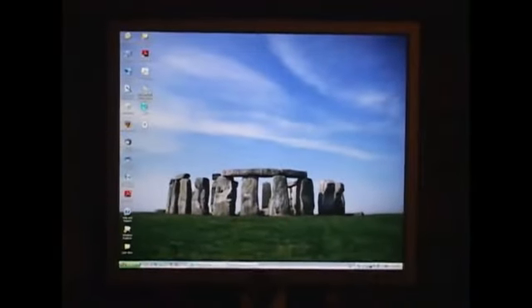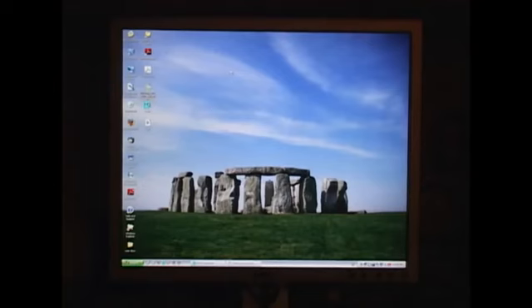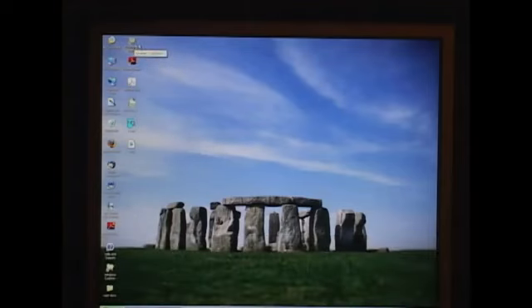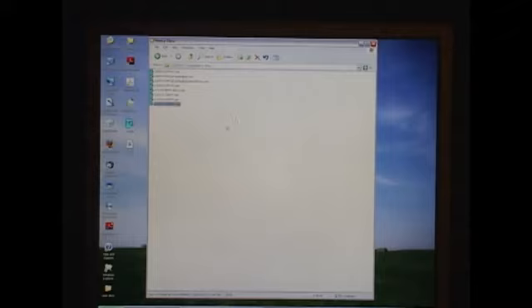You can minimize it, get your data out of your scans, make sure that you remember to fill in the log, and you may remove your sample and you've finished your scan. Your scan file is automatically saved to a scan folder, and we have a shortcut to it on the desktop. What people do is they find their data when it's finished, and with a USB drive, we also have a 3.5-inch floppy and CD, whatever you have. Just find your sample and save it to whatever drive you have. And this sample can be opened in X-Ray Diffraction software designed for that.